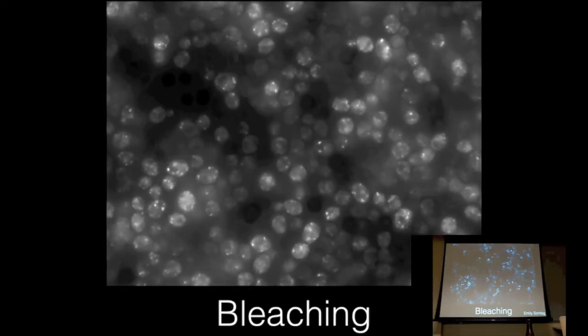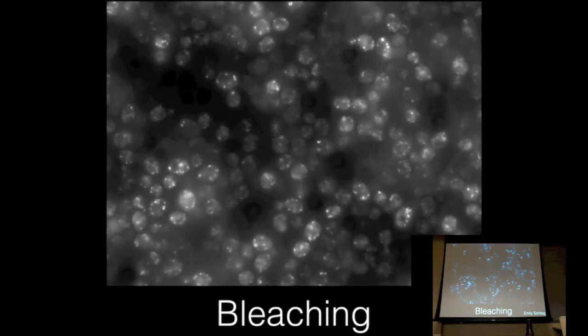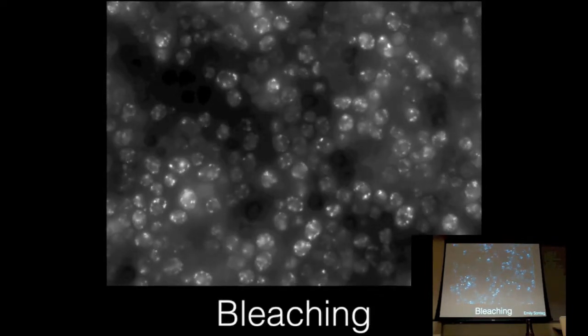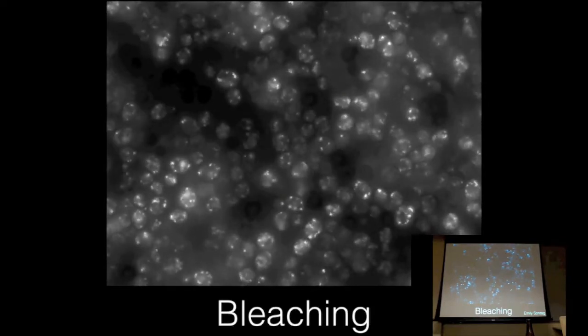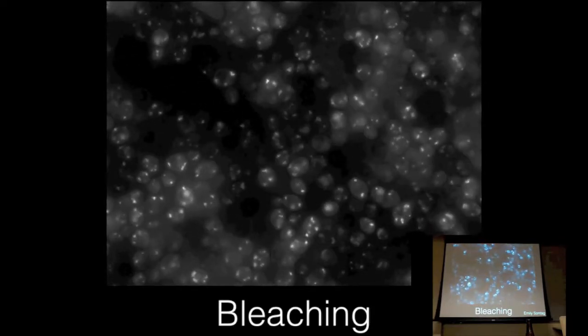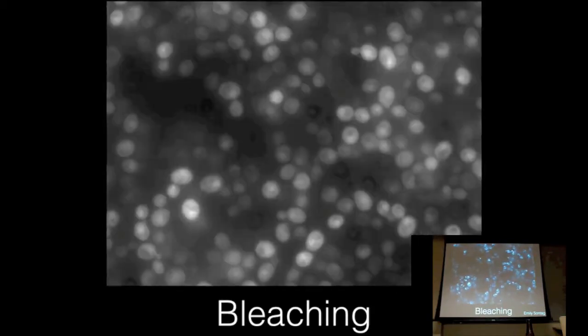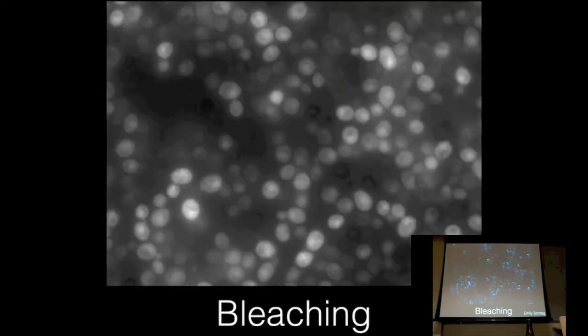These are yeast cells, and the protein that you see is one that gets misfolded upon heat stress, so it will form these inclusions. These are just wild type cells, and we are studying chaperones and protein folding systems. So we try to see how different chaperones affect the occurrence of these puncta, their spatial localization, and the coalescence of these puncta.